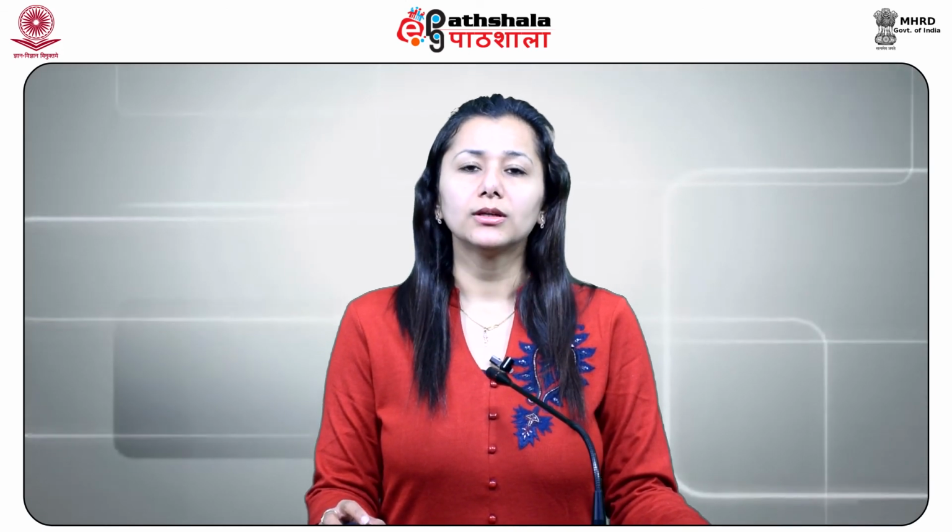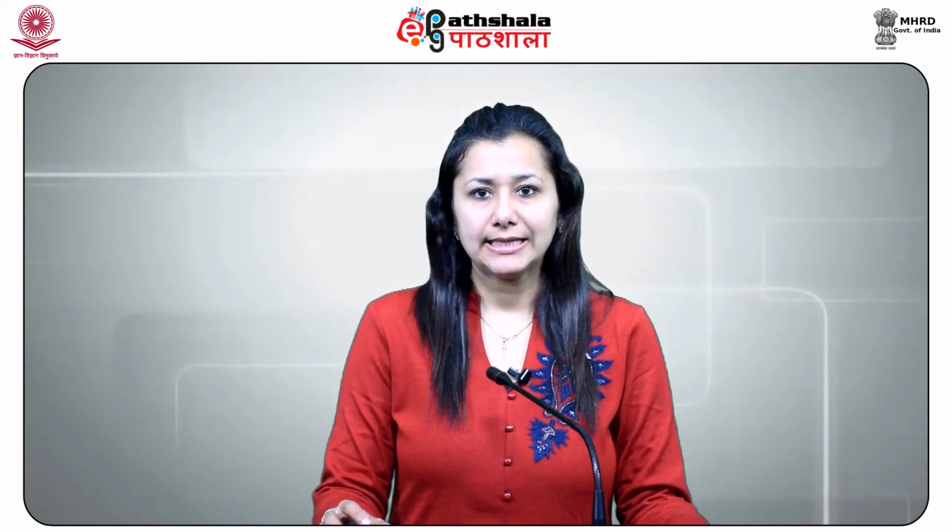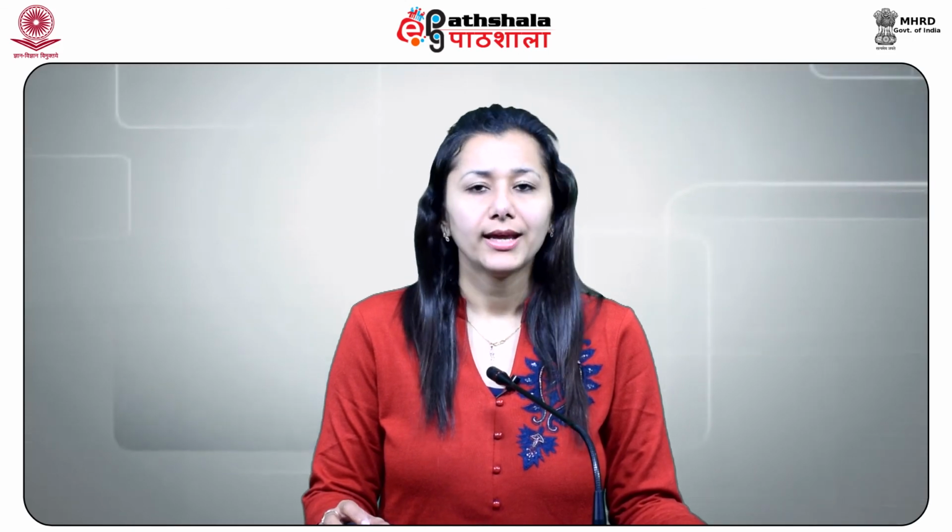Flame photometric detector, FPD, is famous for its hydrogen-rich flame because it's much cooler than the oxygen-rich flame which is used in the flame ionization detector. A chemiluminescent reaction is used by the flame photometric detector in the hydrogen-air flame. The flame photometric detector is sensitive for sulfur and phosphorus comprising molecules. It is used for qualitative analysis of elements by comparing emitted wavelength with the standard. Flame photometry is used in quantitative analysis for determining the concentration of group 1 and 2 elements.